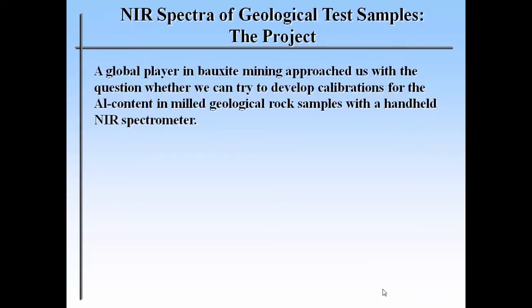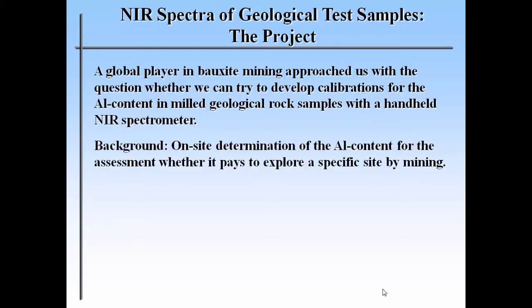Another NIR project, geological test samples. The company which came to us is a global player in bauxite exploration. What they do is they go to different places, they take samples, and they would like to know very quickly, is it worth to carry on exploring this site because the aluminum content is high enough to guarantee us that we have success in mining. And it would be nice if we can do this on site.